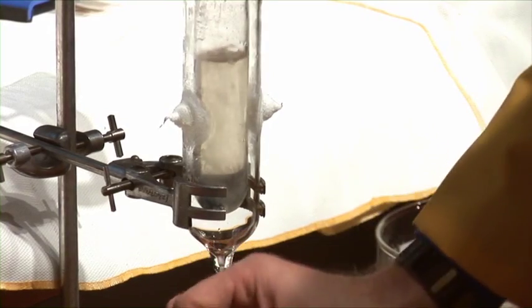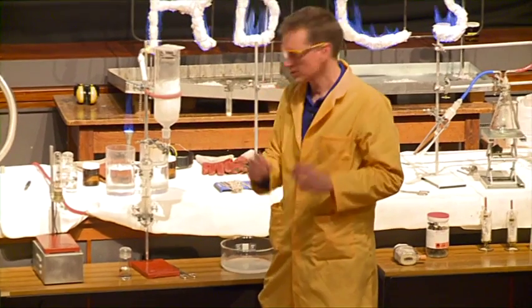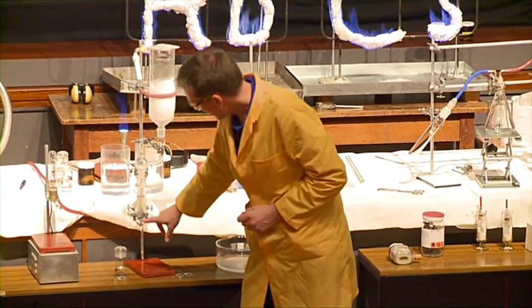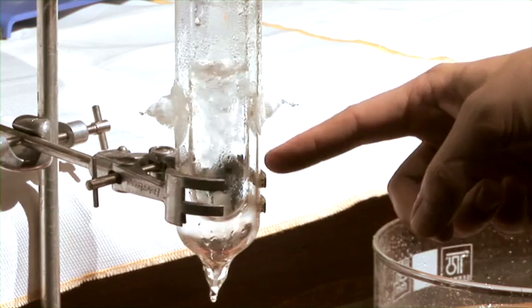So we're forming sodium ions, Na+, and we're losing this outermost electron, and this is giving rise to the blue colour that we're seeing.